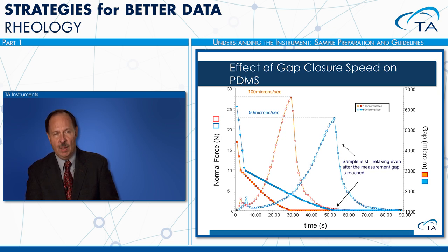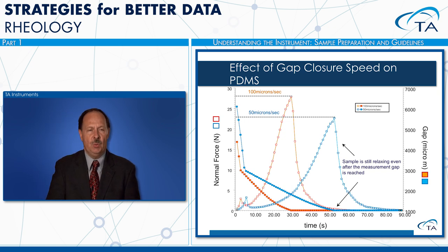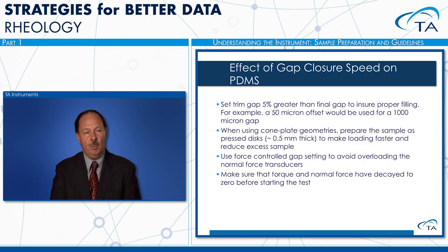With 50, we developed a certain normal force, but you can see these are still taking a while to relax. So depending on what your material is like, you could find better rates to use. You try to get that done as quickly as possible, but without having any long-term effects on your measurements.